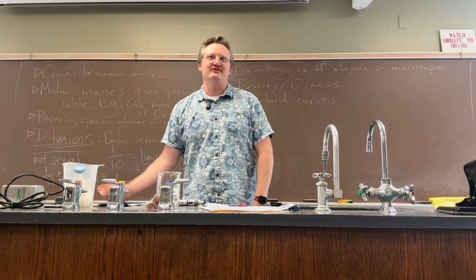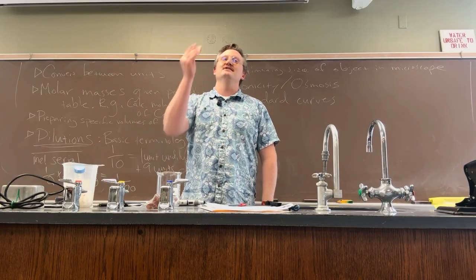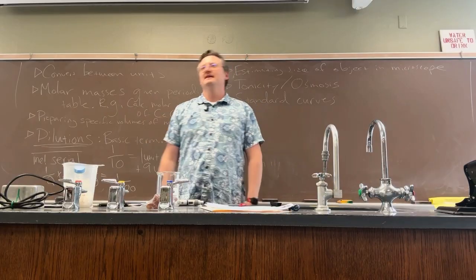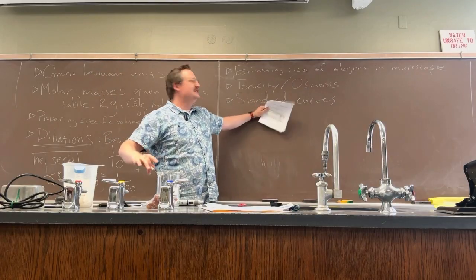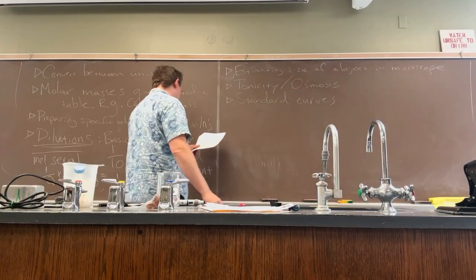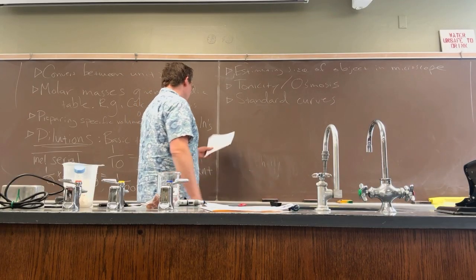In the lab final, I try to trick you by saying, you do a 1/20th dilution, and then you measure this absorbance. What was the concentration before the dilution? So it makes you do dilution and standard curve. This one's going to be the most basic, bare bones standard curve question. You got to know what they are. Cool? All right.